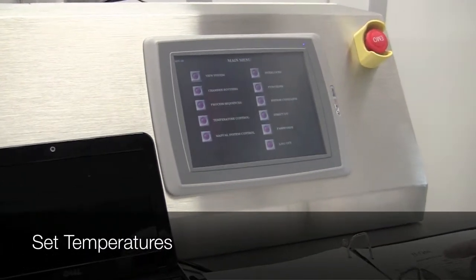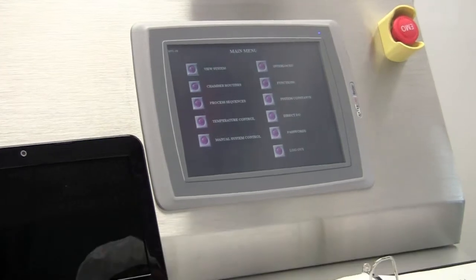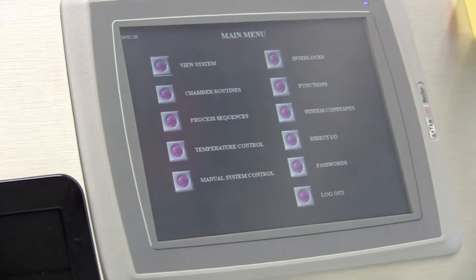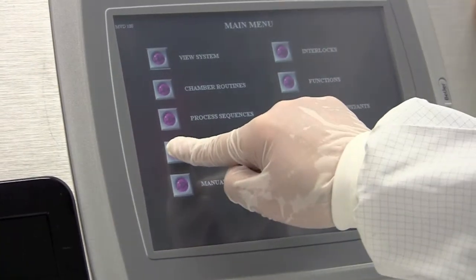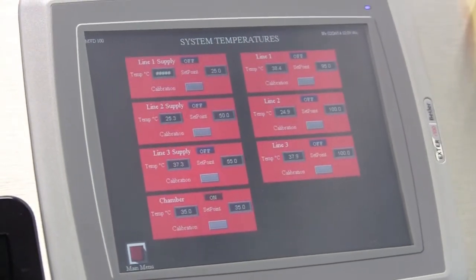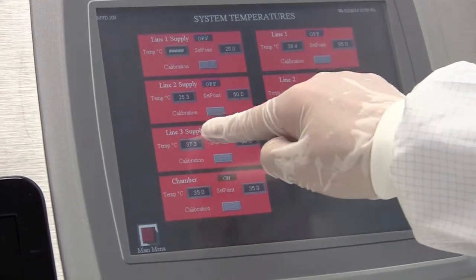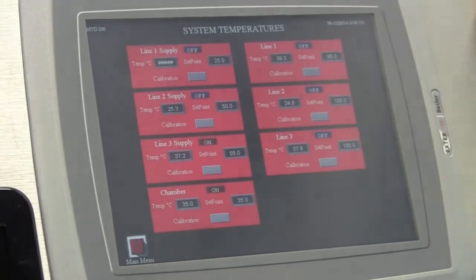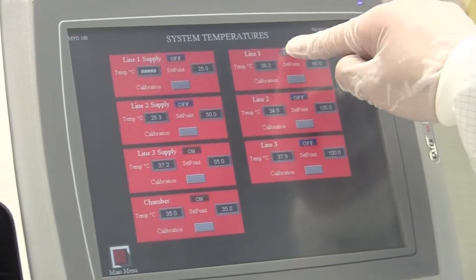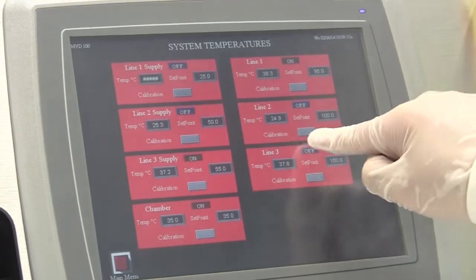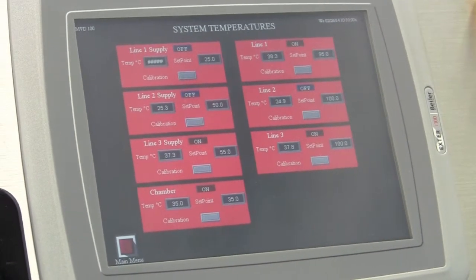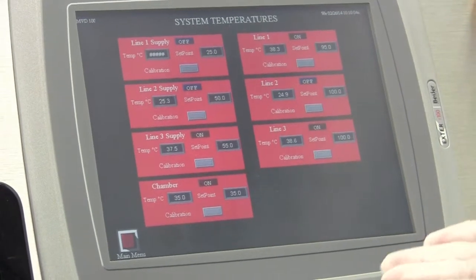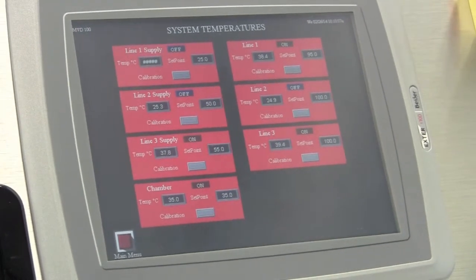Now we need to set up the temperatures for two supplies. One is water, the second is FDTS. So here we need to turn on the line 3 supply by touching this toggle button. And now it's on. We also need to turn on line 1 and line 3. And then we will wait 5 to 10 minutes until the temperature meets the preset temperature.